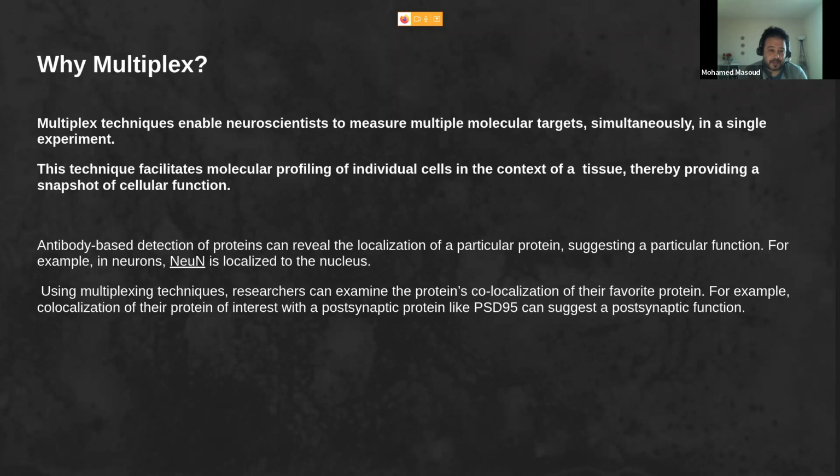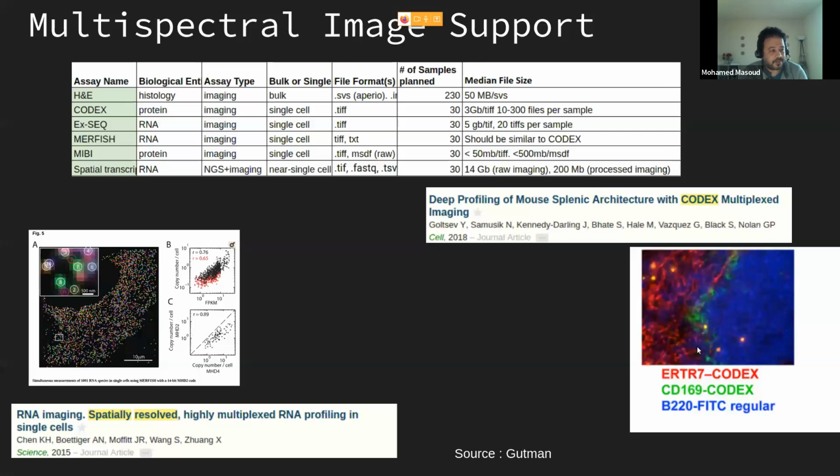There are multiple technologies that have recently been developed, ranging from protein panels to RNA panels, and they give us an imaging output in most cases.